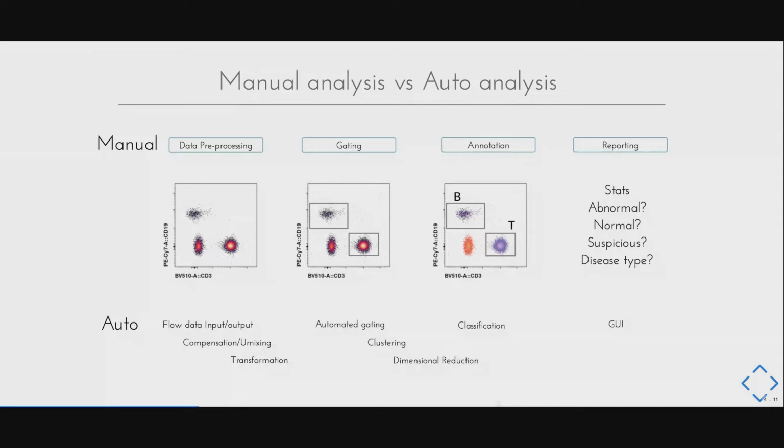So this slide summarizes automated analysis modules and strategy we've discussed, comparing manual versus auto analysis. The automated analysis provides great flexibility, enabling the integration of automated 2D gating, finding suspicious populations by clustering, optimizing the data visualization, and offering customized functionality beyond those provided by commercial softwares.